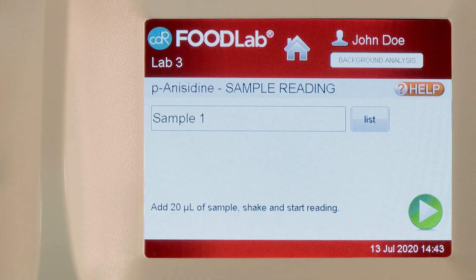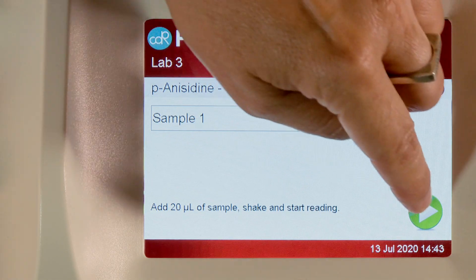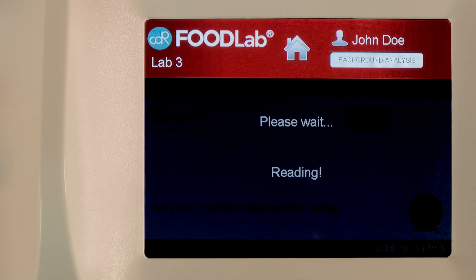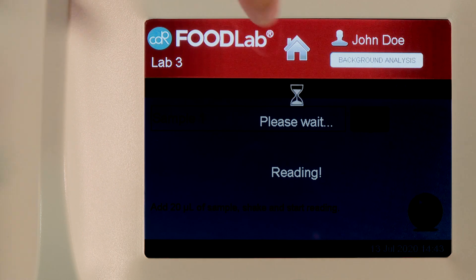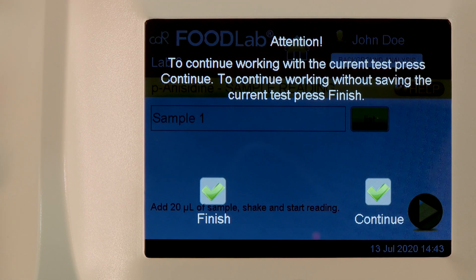Then, press Next to start the photometric reading. Meanwhile, press Home to go to the third analysis.